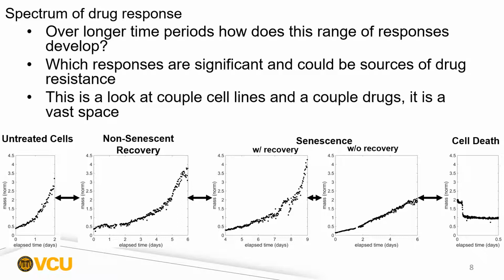As this is a vast space, because using different drugs will result in different responses and different cells will result in different responses as well, we just wanted to open a window into what's going on here. And the first thing we wanted to look at was cell death.